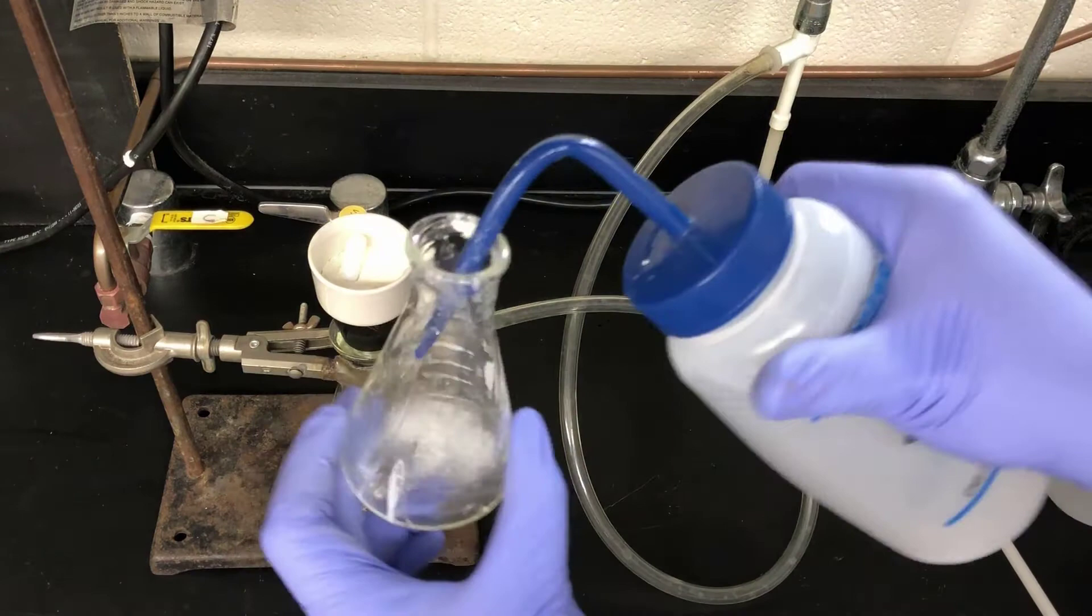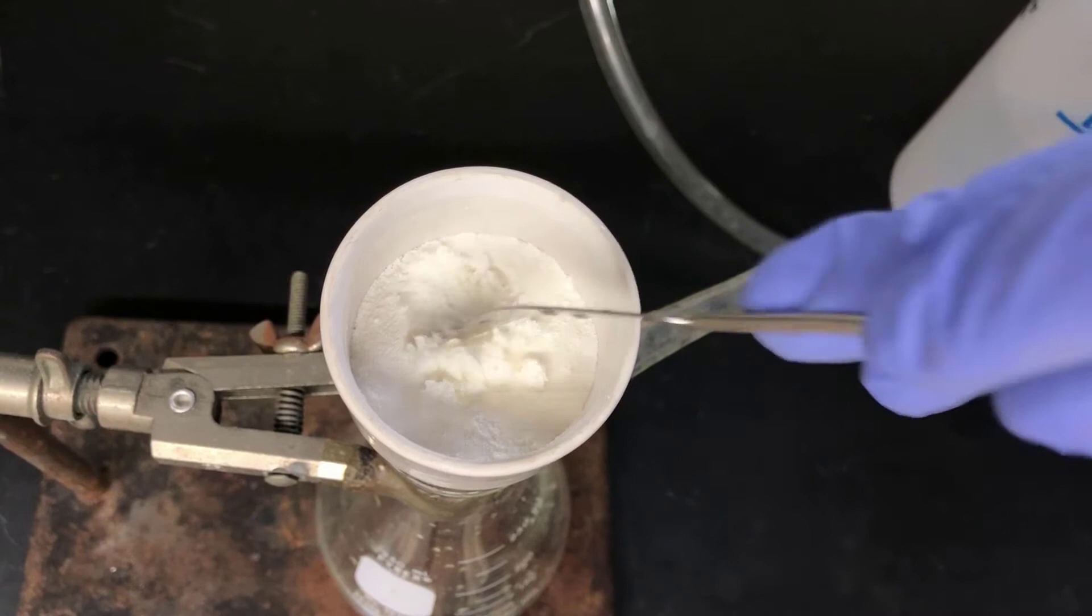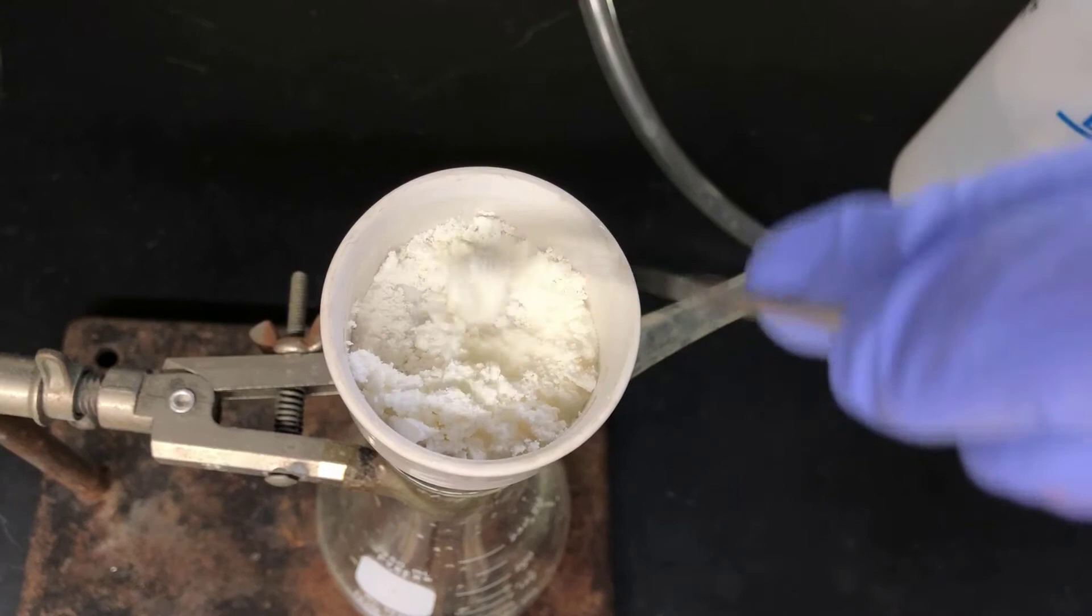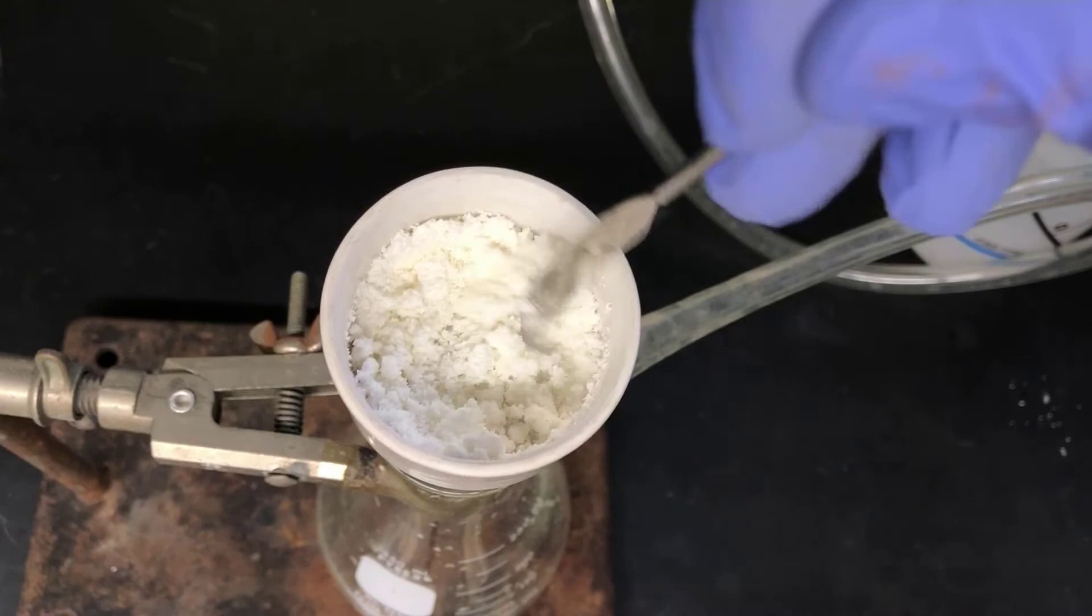Here's a close-up view of the product in the Buchner funnel. It's a white powder, but it's still wet with water. Ideally, it should be completely dry before you attempt to get a mass on it and a melting point. The best-case scenario is to let it dry in your drawer over a week and then take the melting point the following week. If you can't do that, then pull a vacuum over the product like this for about 15 minutes or so to get it as dry as possible. If there's any water left on it, that'll act as an impurity and depress your melting point and probably broaden its range.